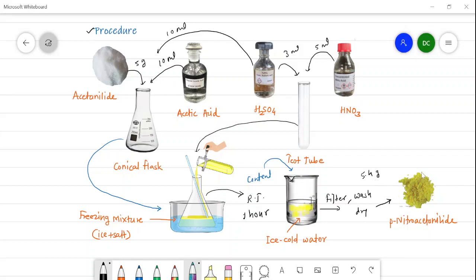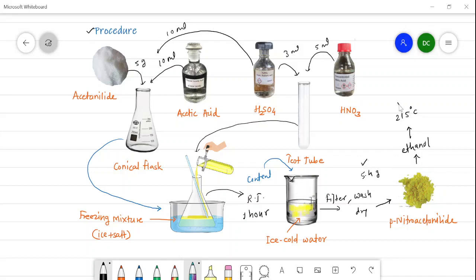This crude product is recrystallized from ethanol, and the pure product obtained is taken for melting point determination. The melting point of this product is observed to be 215°C. That is the observed melting point taken in this practical, so the amount is 5.4 g and the melting point is 215°C.